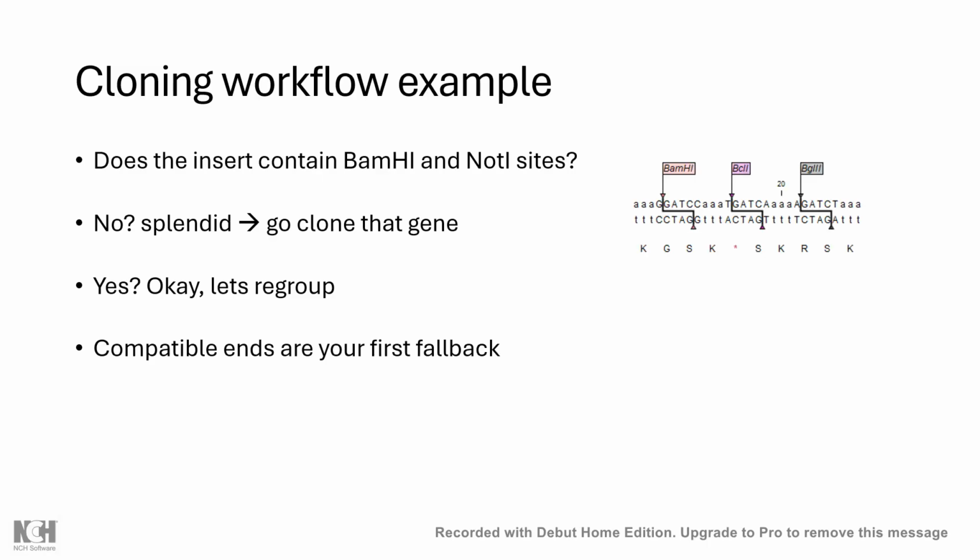So here we have a little family portrait of BamH1, and most of you will have heard of BglII. I like to call it Bagel because I love bagels, and it similarly, apart from having a different recognition sequence outside of the sticky ends, it has A instead of G, it still spits out a GATC overhang, so that will mate up deliciously with your BamH1 site.